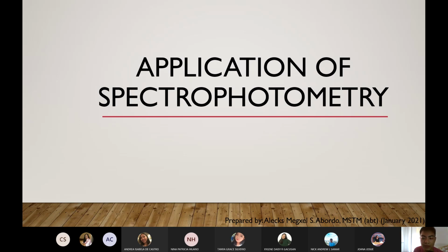So yung concept na yun, ginagamit yun sa UV-Vis, no? Okay? So when you pass through a certain wavelength, no? The sample will absorb that wavelength, no? Okay? And based on the absorption of the wavelength of light, no? Ayan, you can quantify chemical substances. Okay? So basically, yun lang yung concept ng lecture. No? But for now, we will just focus on the additional concepts, additional terms, and of course, yung how do spectrometers work. No? So yun lang di-discuss natin today. Puro concept lang. Okay?